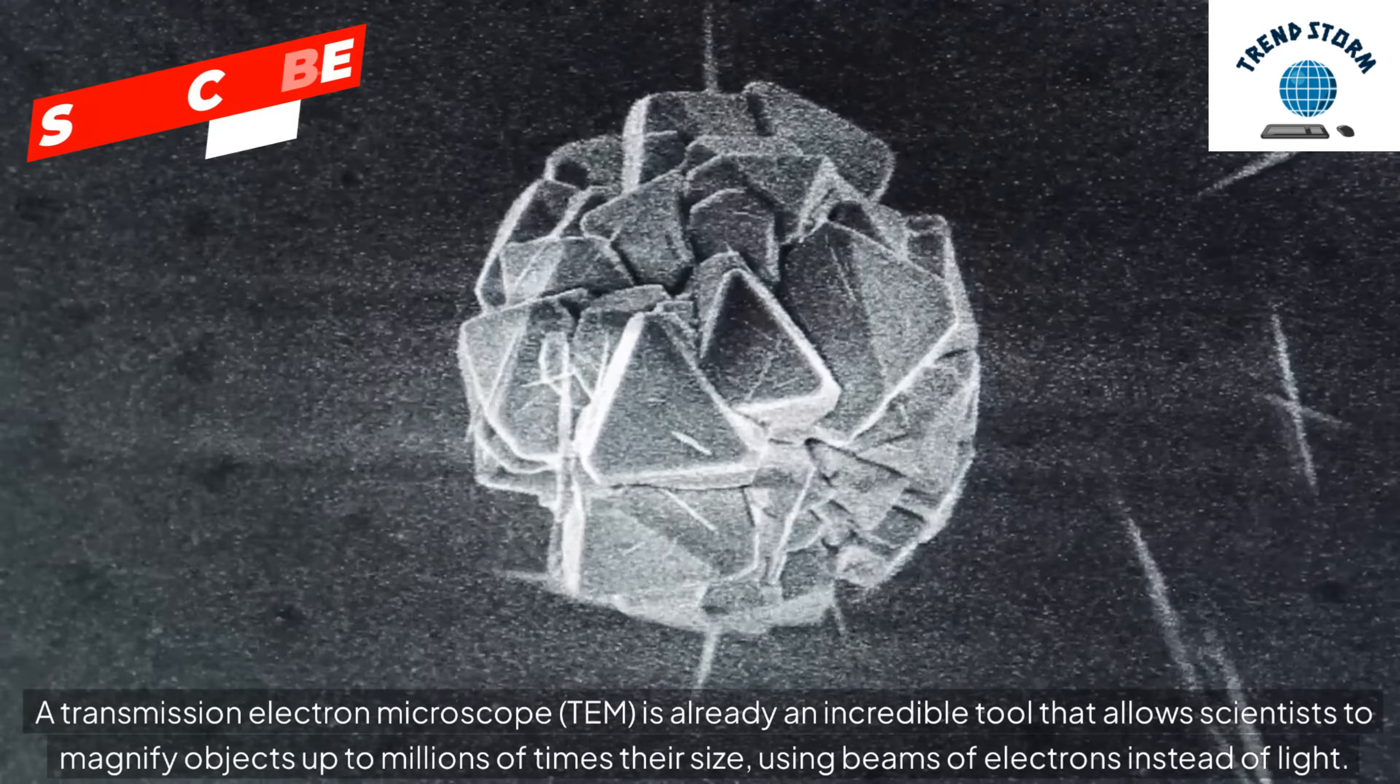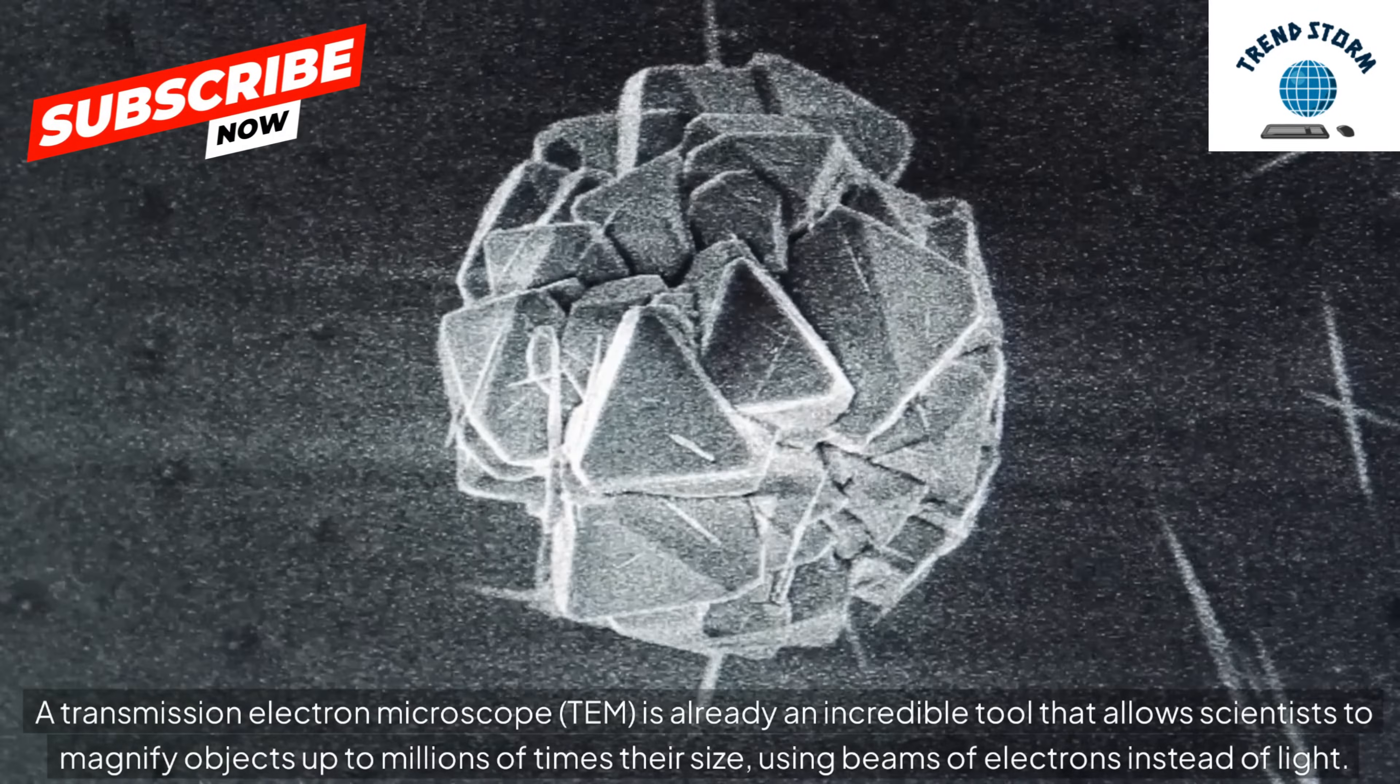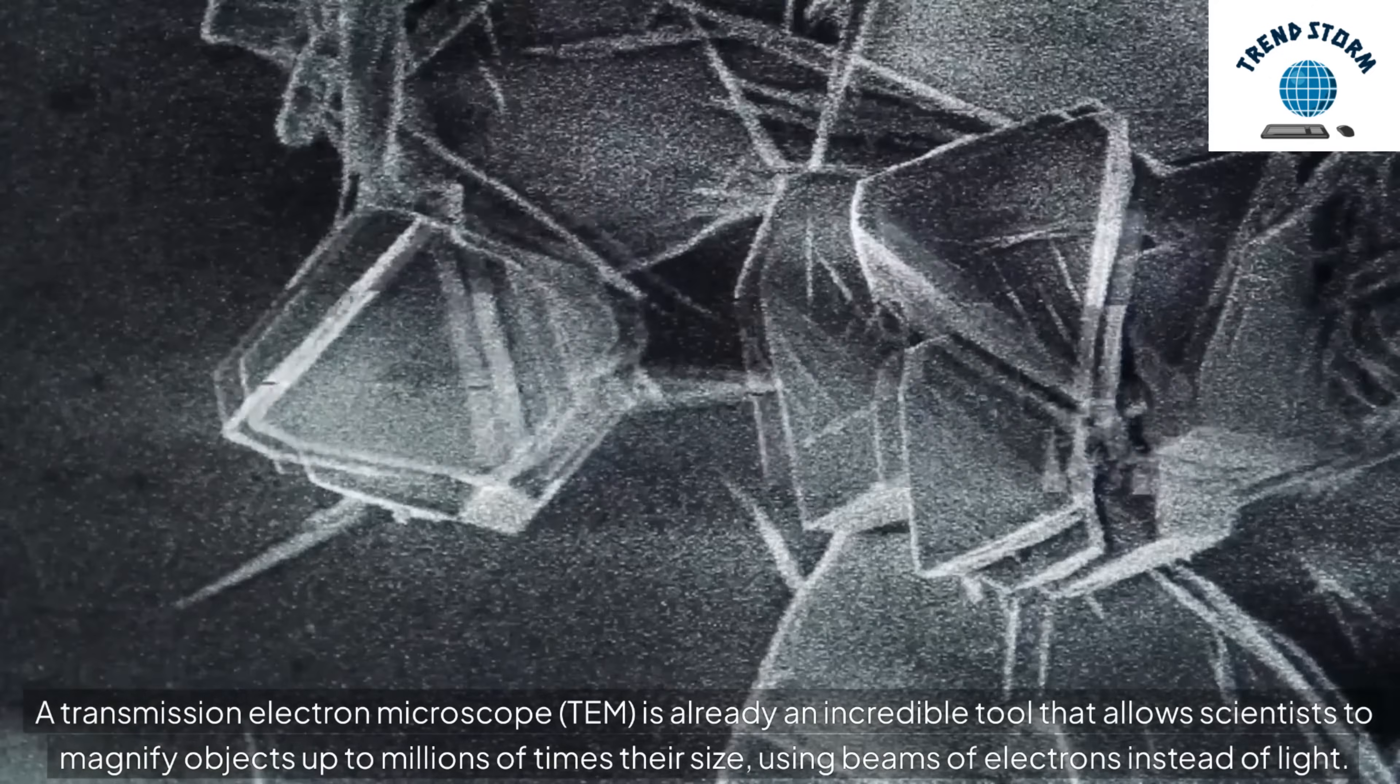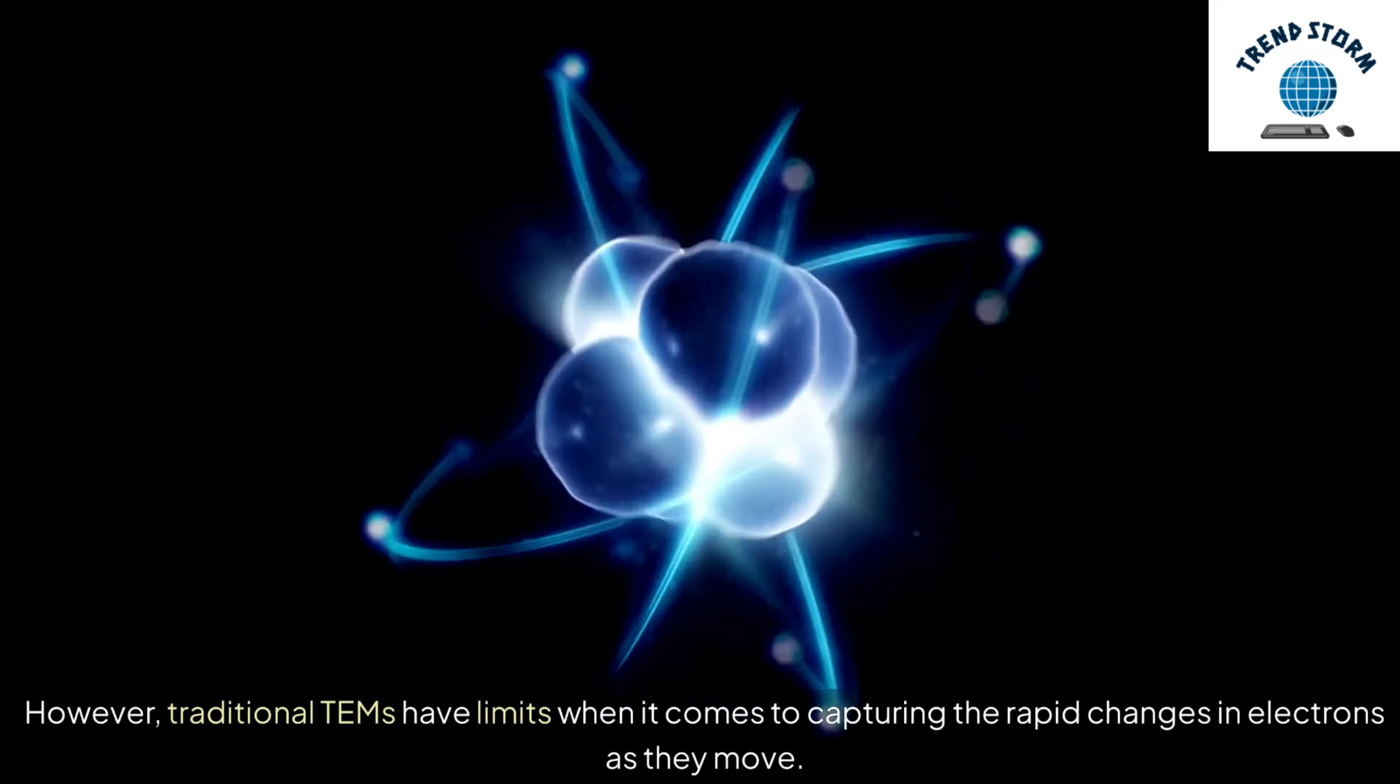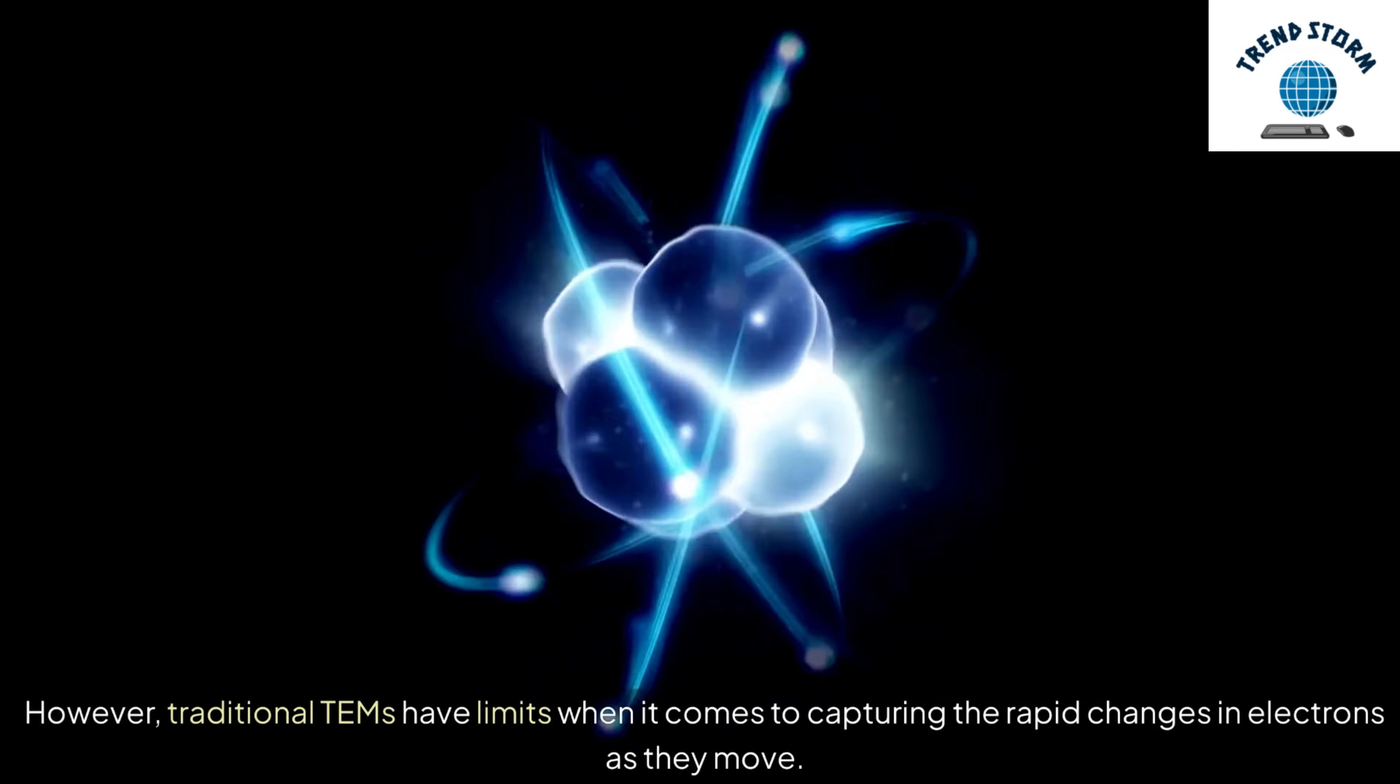A transmission electron microscope, or TEM, is already an incredible tool that allows scientists to magnify objects up to millions of times their size using beams of electrons instead of light. However, traditional TEMs have limits when it comes to capturing the rapid changes in electrons as they move.